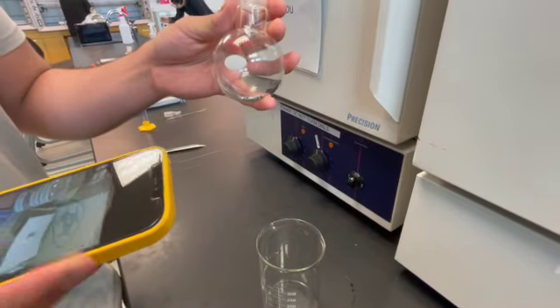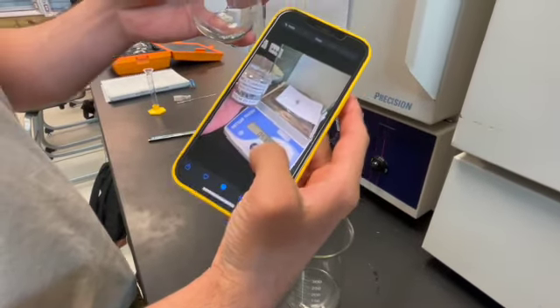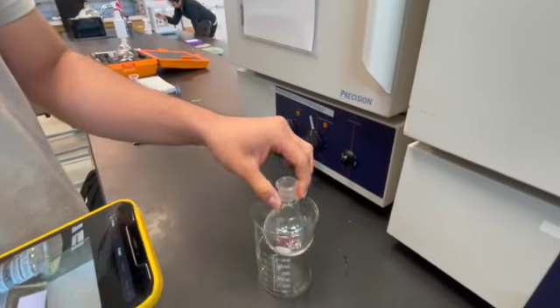In this round bottom flask we have 0.53 grams of magnesium, which we will place inside the beaker in order for it to dry out for five minutes.